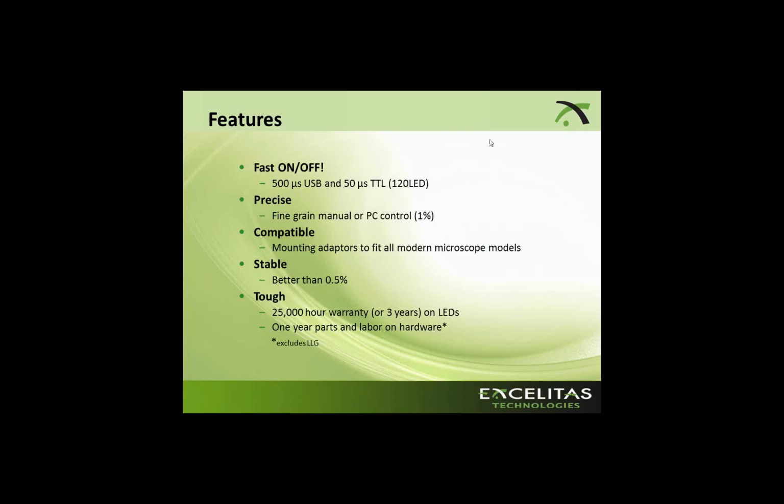As far as the intensity control, they're usually around 1%. They can fit on all microscope models, even if you have an old microscope that you want to upgrade with a new lamp or LED. It's something that can be done because most LED manufacturers will adapt to existing and old microscopes as well. Stability, we talked about, depending on the unit, can be better than 0.5%. And as I talked about lifetime, these things last forever, and you don't have to really do anything to them other than avoid dropping them.